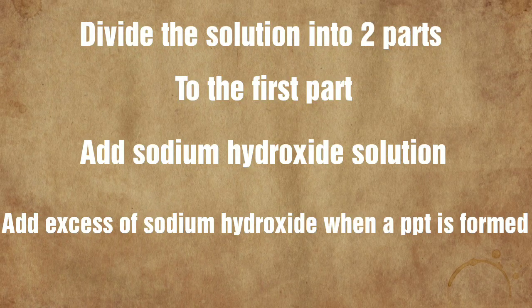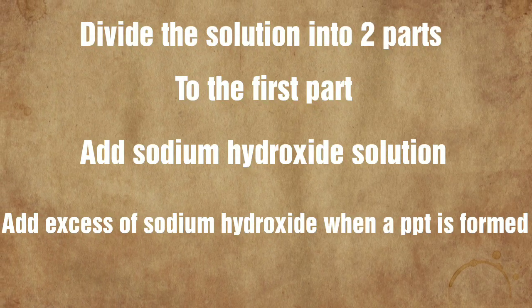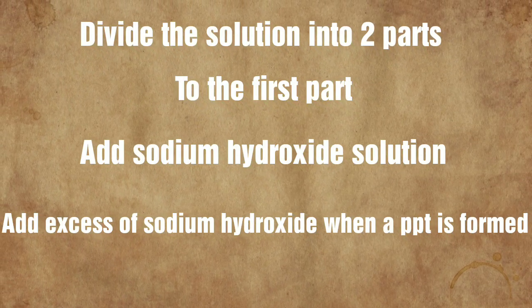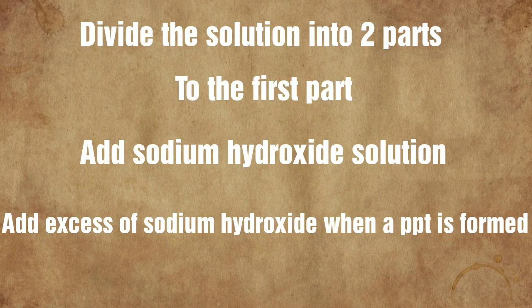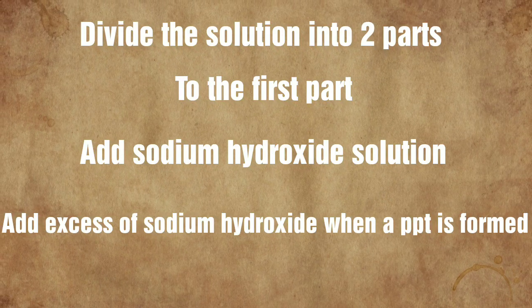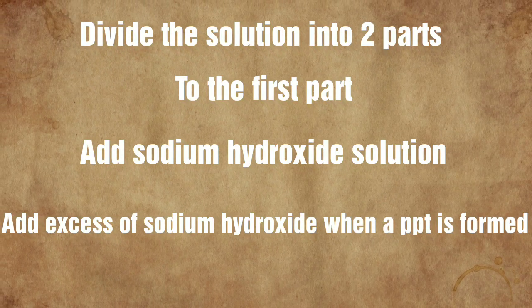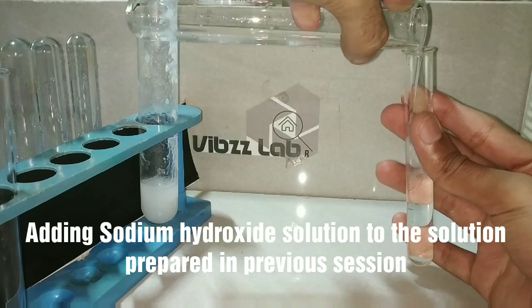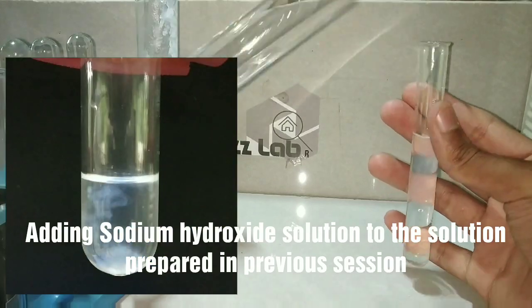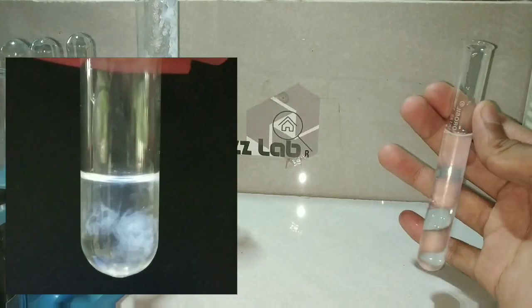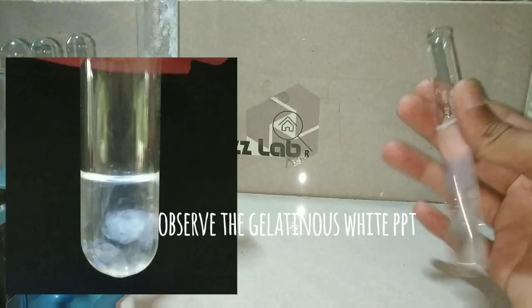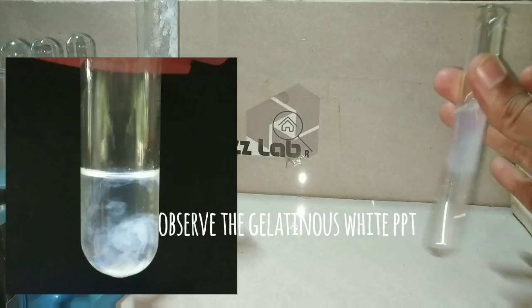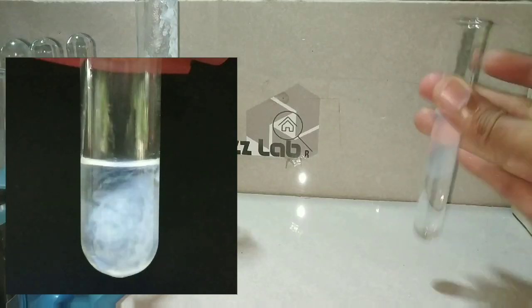Now we will be dividing this solution into two parts and we will be doing the confirmatory test. The first confirmatory test is to add the sodium hydroxide solution. Here I have taken the solution and I am adding sodium hydroxide. You can see that there is formation of the gelatinous white precipitate.